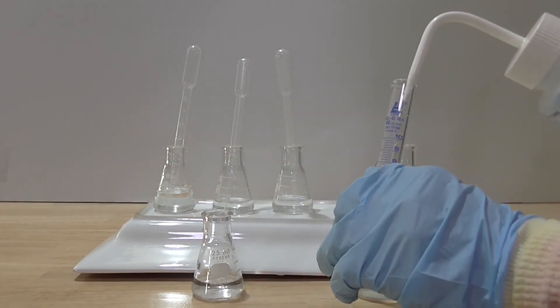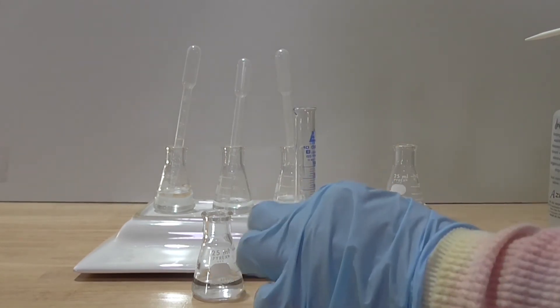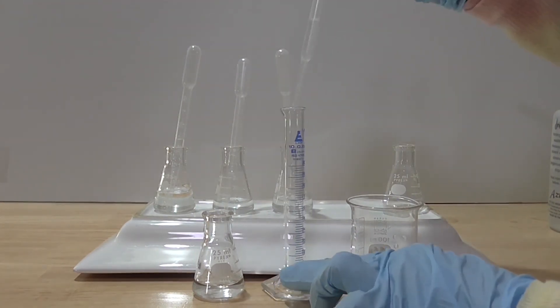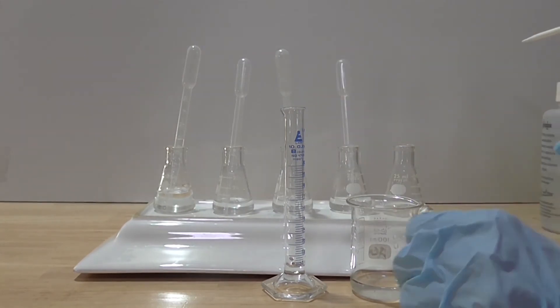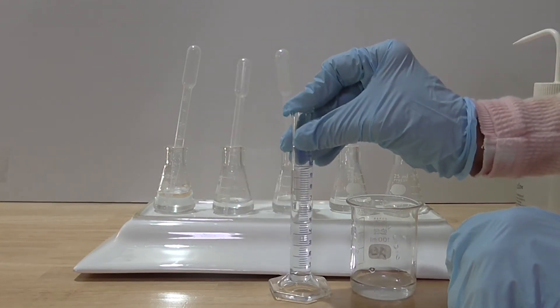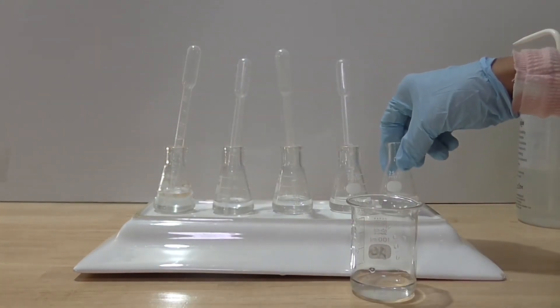I wash and dry the measuring cylinder. I am now ready for my next dilution. I pipette in one milliliter of the 0.001 molar sodium hydroxide into the measuring cylinder. Pour in 9 ml of water. Ensure the solution is well mixed. The concentration of the sodium hydroxide in the measuring cylinder now is 0.0001 molar. Pour in the 0.0001 molar sodium hydroxide into a clean dry glass flask.